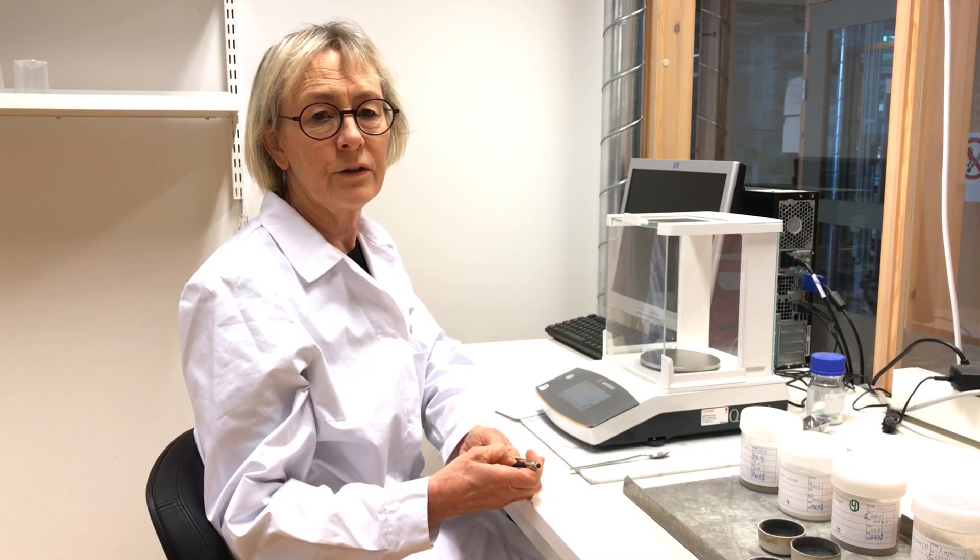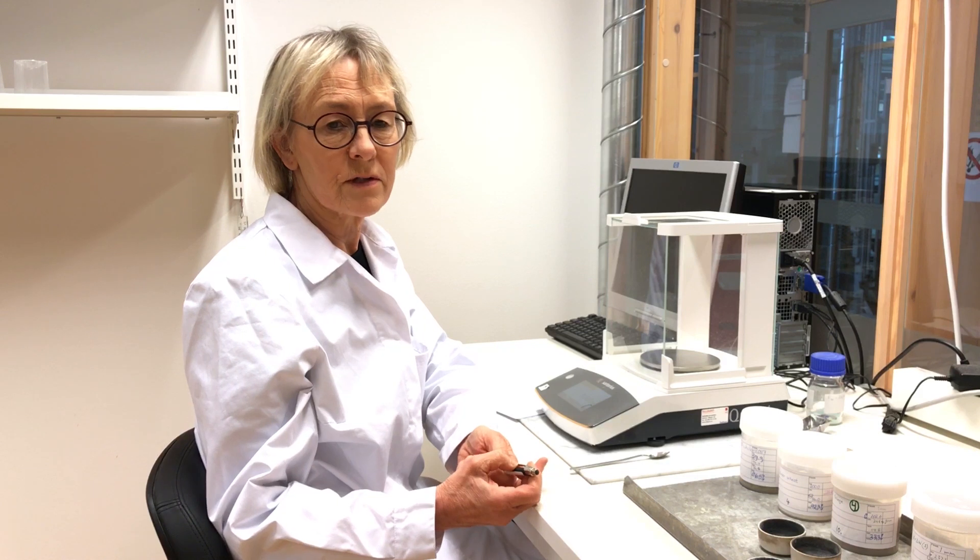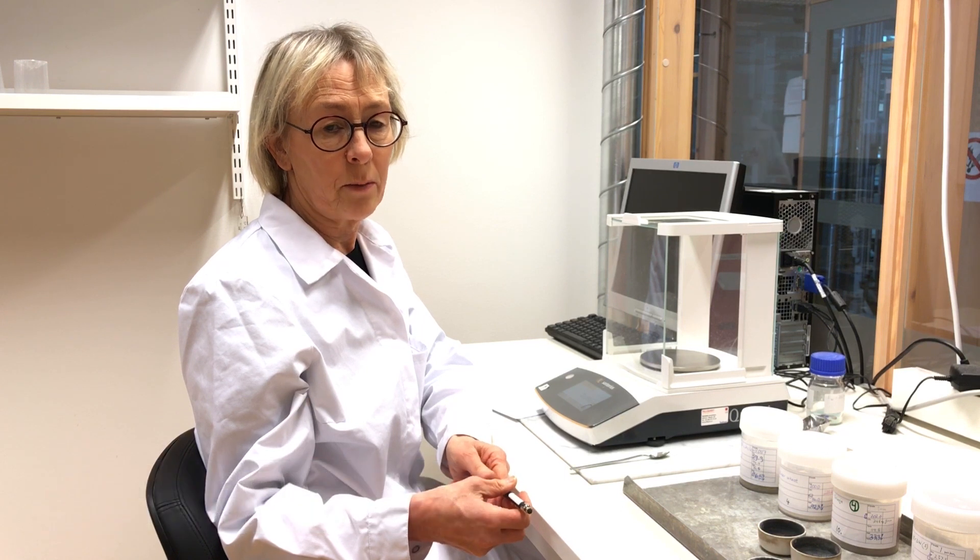To know the dry matter content in your samples is really important because when you analyze your samples you refer the content to the gram per kilo dry matter.